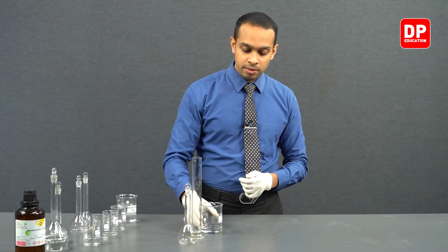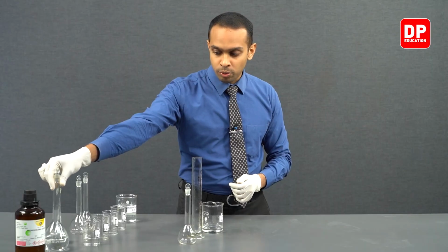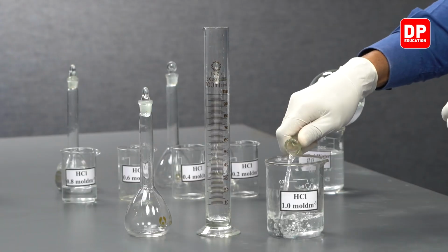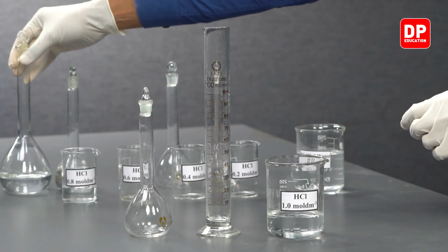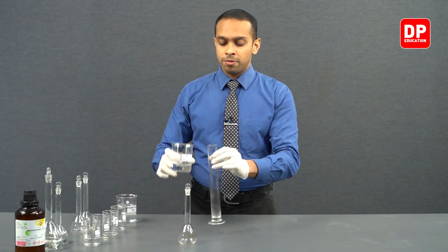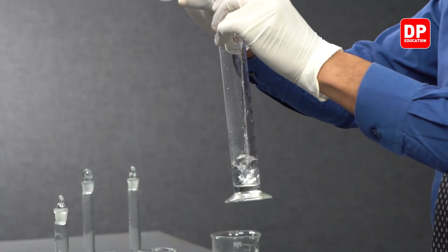So let's take our HCl solution over here, 1 mole per decimeter cubed HCl solution, and then measure exactly 60 milliliters of it.